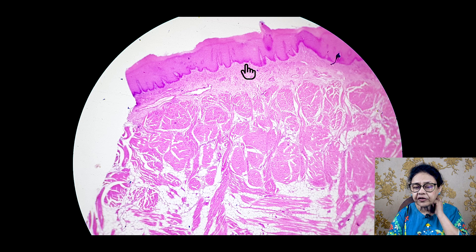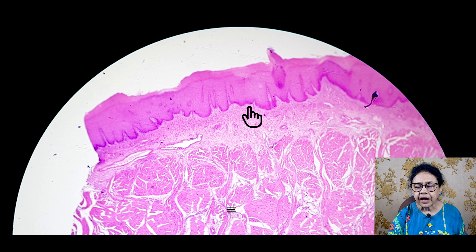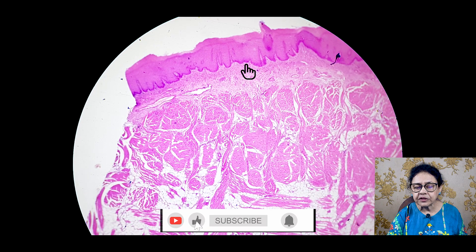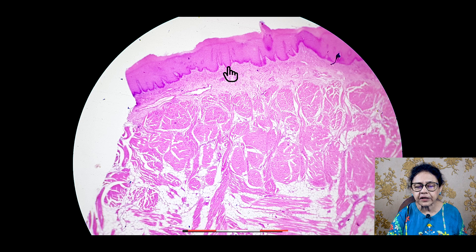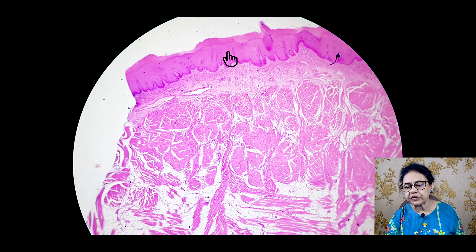Why is there stratified squamous epithelium? Because when you take rough food, part of the epithelium is damaged in the superficial layer, and new cells coming from the basal layer occupy this region. So always the basal layer in case of stratified squamous is dark. This is the characteristic feature of the stratified epithelium.